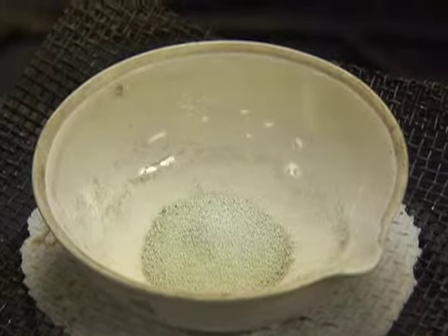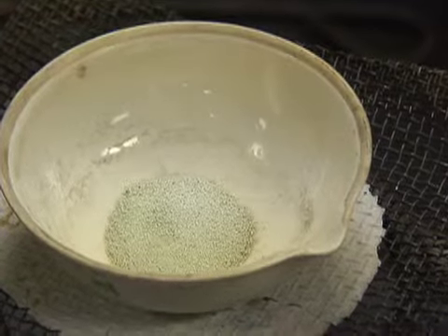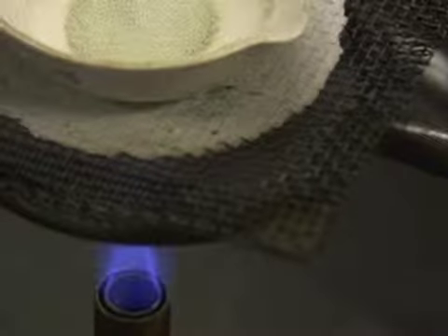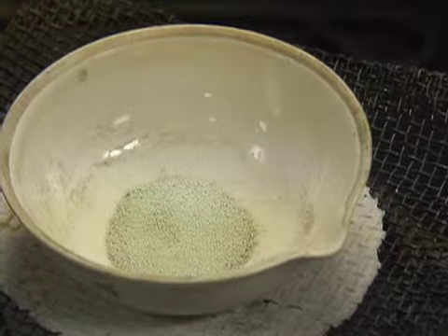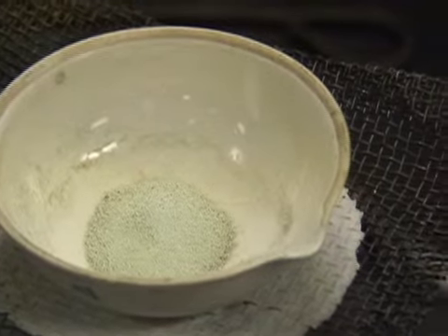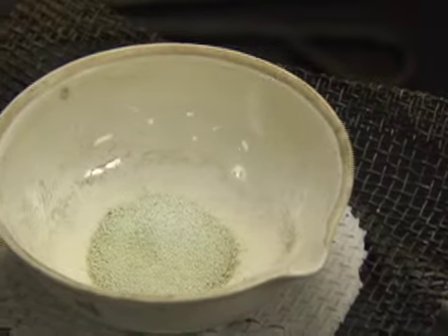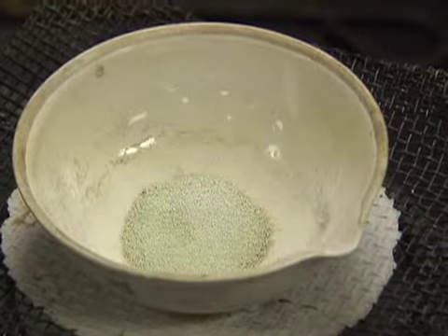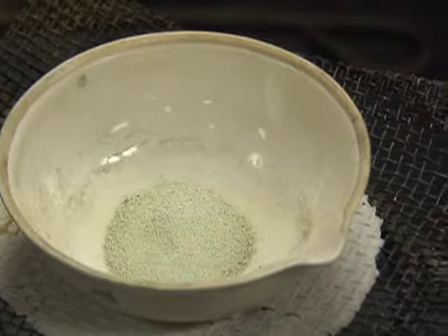Now, we never accept weighing something warm as one of our sources of error because that could damage the scale. We don't want to do that. And also, when you take the measurement of something that is warm, hot air rises, and that would cause the evaporating dish to be buoyant and our mass to be less than what we would expect. We never want to weigh things warm. We want to make sure that they are definitely room temperature.